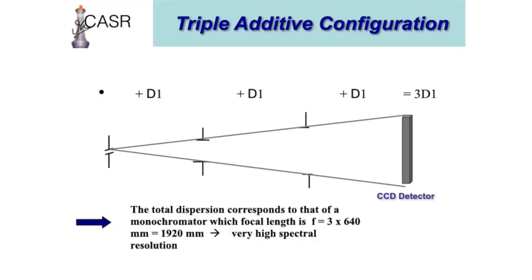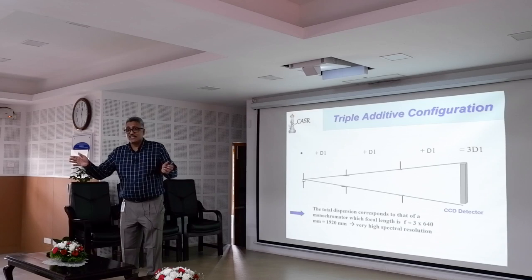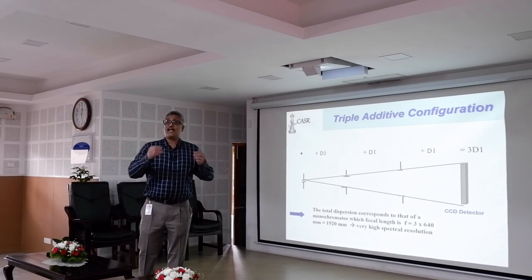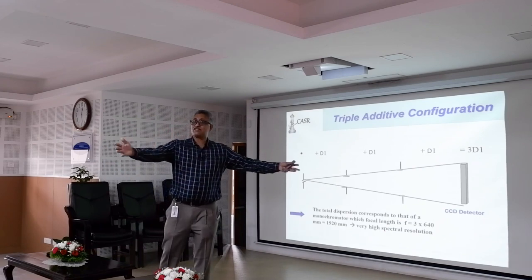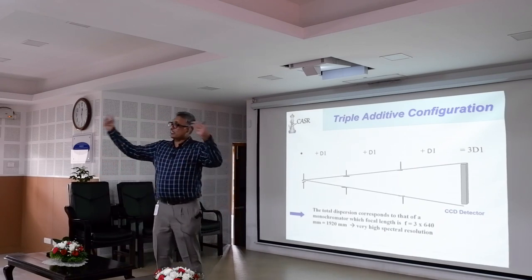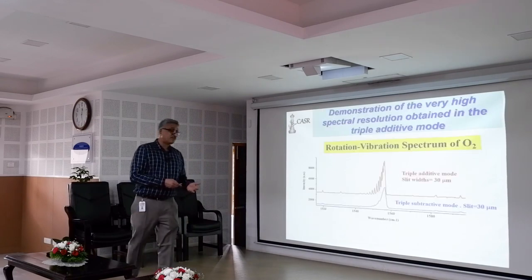Next is resolution. How much can I resolve? That is there. So it also depends on resolution. I told you one grating resolves this much. If I take that and put another grating, I can resolve more. So if I have more number of spectrometers, I can actually resolve more. And you can see this very easily.